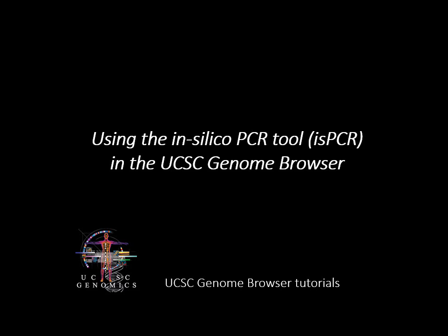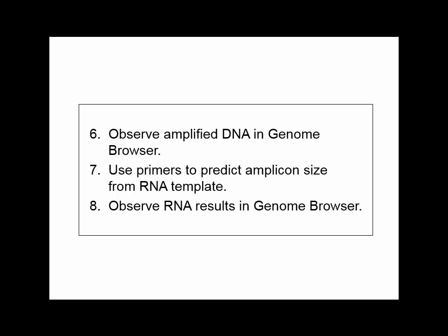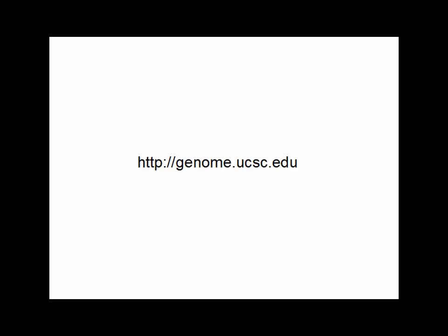In this tutorial, we will explore the UCSC Genome Browser's in-silico PCR tool. This tool allows you to predict the sequence and size of products that would result from a polymerase chain reaction experiment using primers you may wish to use.